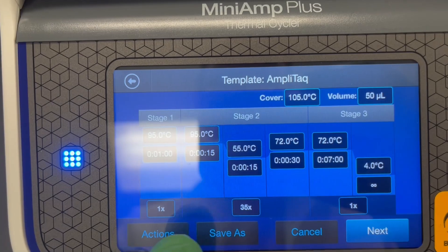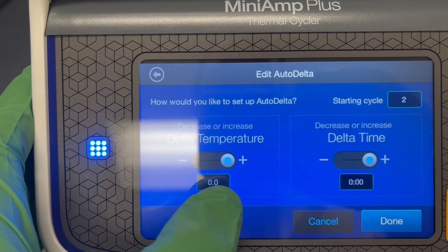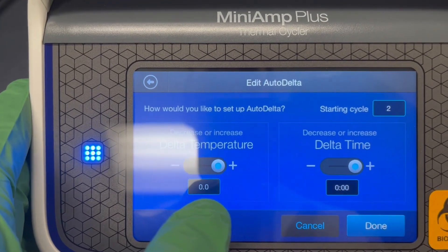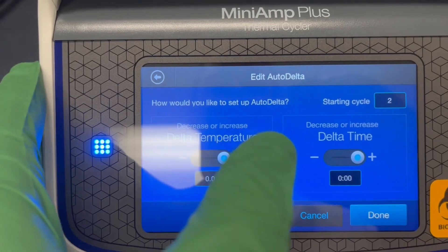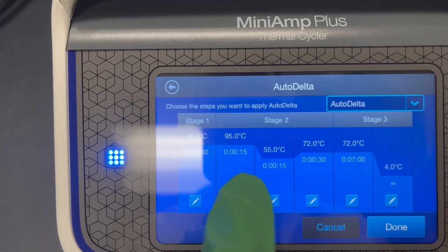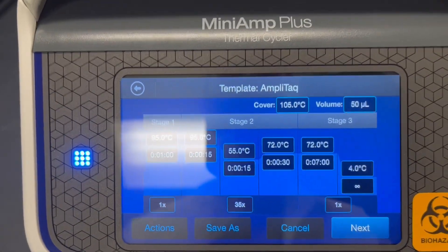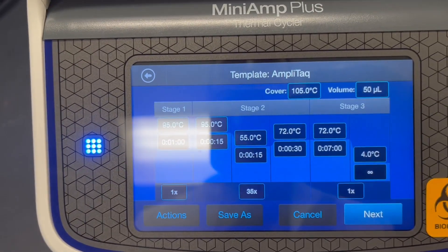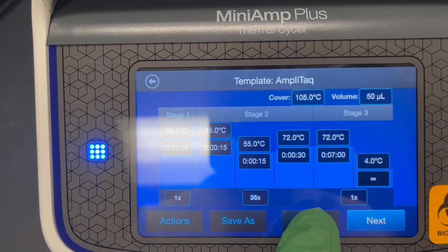There's also under Actions an Auto Delta option which you can apply to a step. This will make the temperature or time change over the course of the PCR reaction — every time the stage repeats, an individual step can change by an automated amount in either time or temperature. So it could get hotter or colder as the stage repeats, useful for a touchdown PCR or any protocol where you don't want a constant temperature or time each cycle.